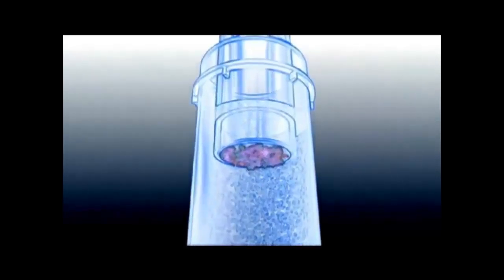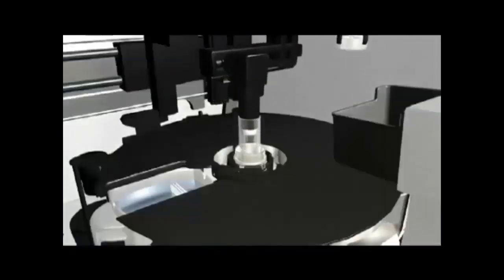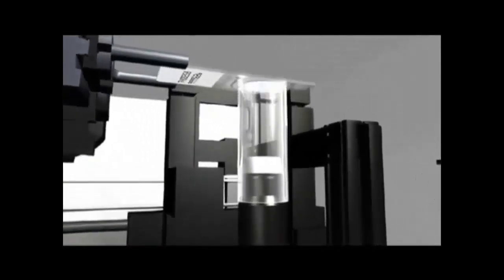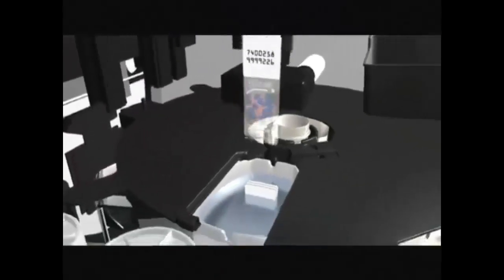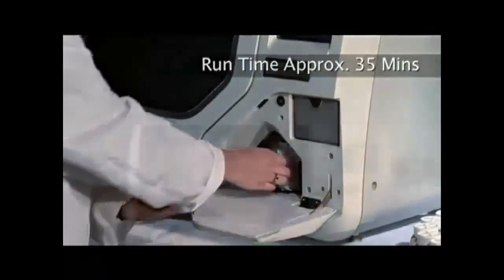This ensures that just enough of the sample is collected to create an optimal thin layer of cells in a 20mm circle. Following cell collection, the ThinPrep Pap test filter is inverted and then gently pressed against the ThinPrep microscope slide. Cells then adhere to the slide in an even distribution in a defined circular area. Once the sample is processed, the resulting slide is placed into a standard staining rack within an alcohol bath. The operator can then unload the slides at his or her convenience.